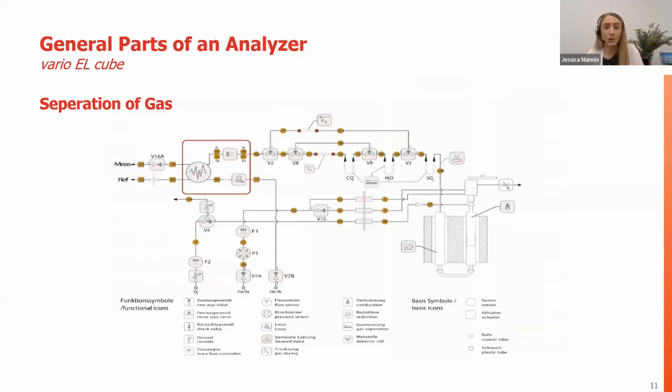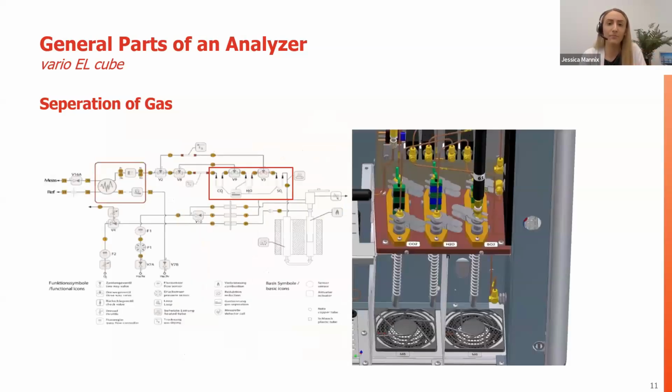After we move to the reduction tube, what happens to the sample gas? So this is where we begin our advanced purge and trap for our gas separation. The sample gas is heated after the reduction tube. All of the lines, we want to ensure there's no trace condensation of water, and that's also to ensure accurate hydrogen and sulfur concentrations. We don't want any sulfuric acid forming inside of the instrument either. So all the lines are heated after the reduction tube, and what happens is that the sample gas in its entirety and its mixture moves through this SO2 column.